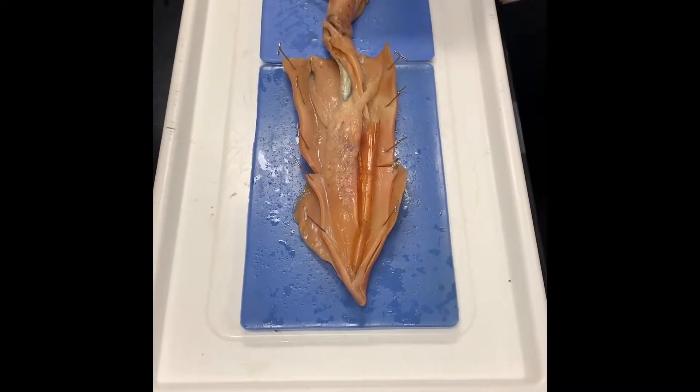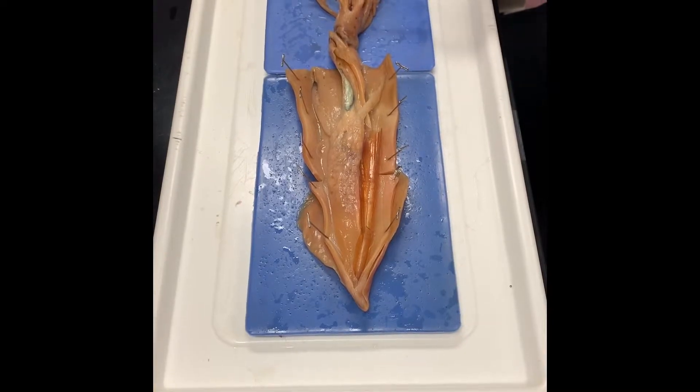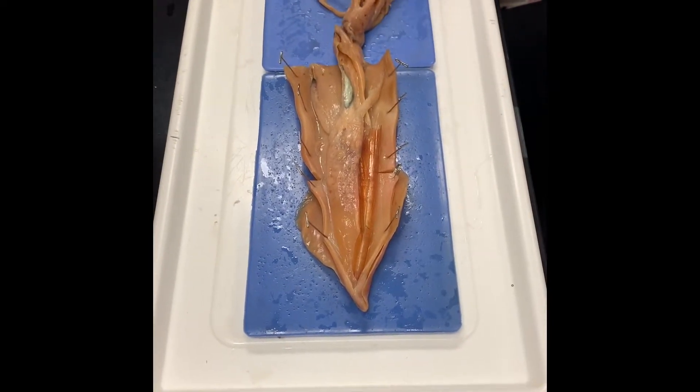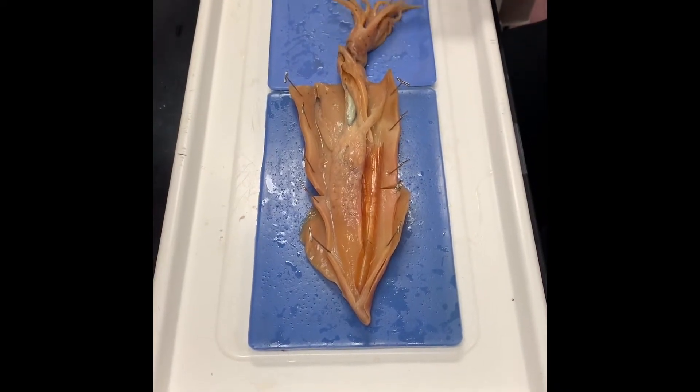It's the arms and the tentacles, but what do we call this area? It's the muscular foot — it's the foot. So the foot of the squid is modified as arms and tentacles. The two longer ones are the tentacles, and there are eight arms.